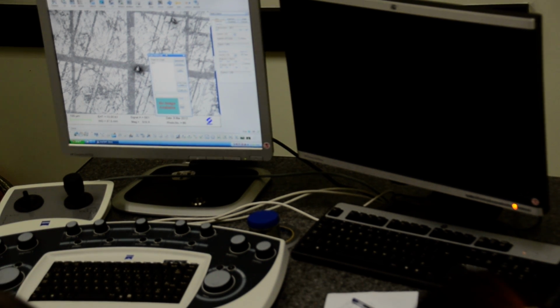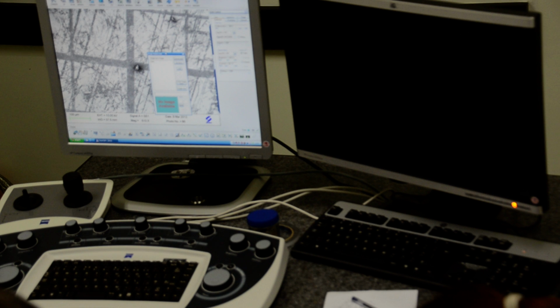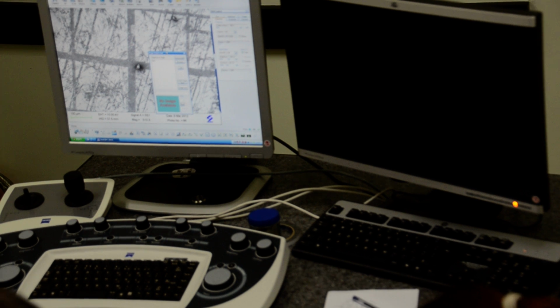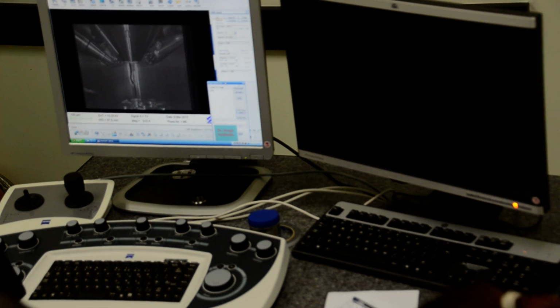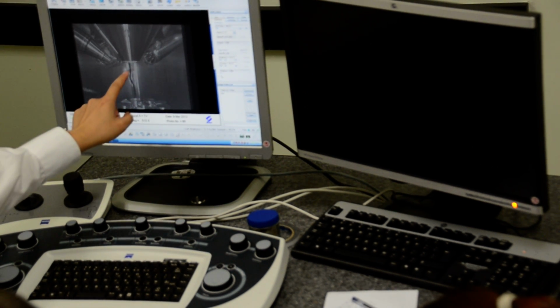Because this time the sample is very flat, and the next time the sample is at a very different height. Maybe in your case you do this kind of sample a lot. Then you want to call a position from this flat sample, but you have no idea how tall the sample you are loading is. So you can imagine you may have the danger of crashing the optics or the detector.